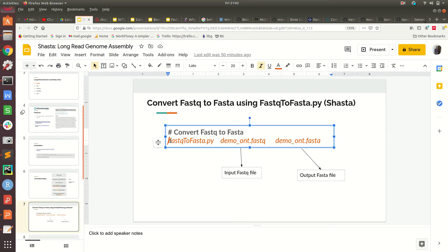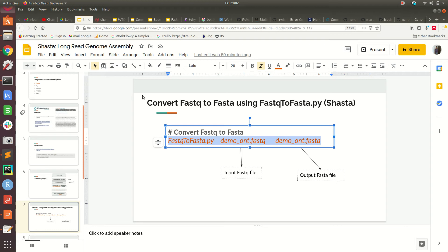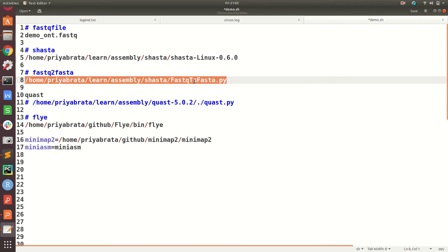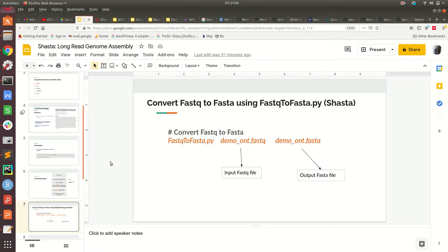Now let's run the conversion. I have the FASTQ file in my system and I'll copy the path. The input file is demo_ont.fastq and the output is demo_ont.fasta. Once the conversion is done, we can check how many reads are in the file using wc -l. There are 4,725 input reads available which we are going to assemble.